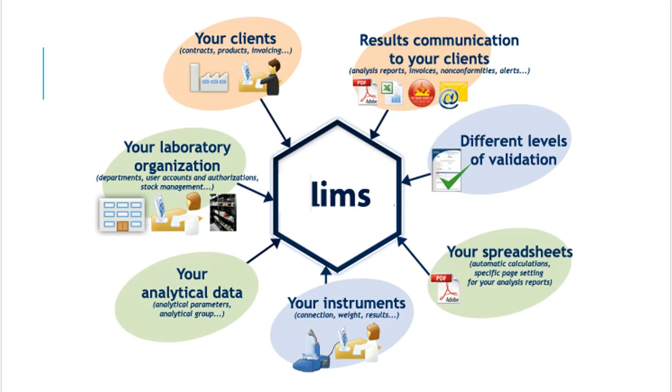As far as the LIMS go, that might be surprising to you, right? I mean, here we've got a LIMS system, Laboratory Information Management System. If you've not picked up on it yet, whenever I repeat something over and over, that probably means that you're going to see it again at some point in time, right? So you know good and well, there's going to be a question, whether it's online or on a test, and it's going to say, what does the abbreviation for LIMS mean? I mean, you know it because I've just said it 3 or 4 times already. So, Laboratory Information Management System.